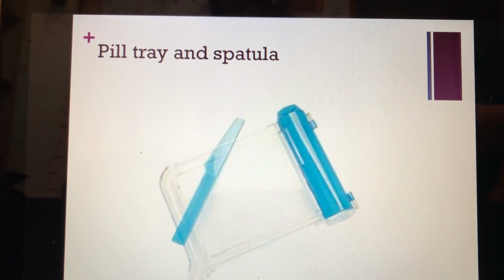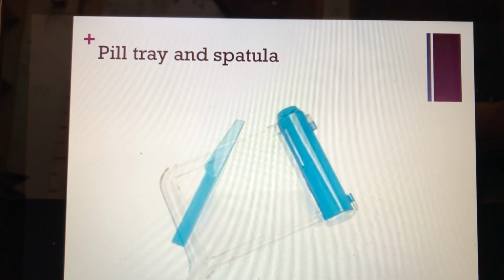We do have a little lab in this course where I'm going to suggest that you practice counting different types of pills and counting in different ways to see what works best for you. I always count in 5s. I think it's fastest. If you count by ones and you have to dispense 120, it's going to take you a lot longer than if you're counting by fives. So I just slide over 5 pills at a time and add them into my ditch here.